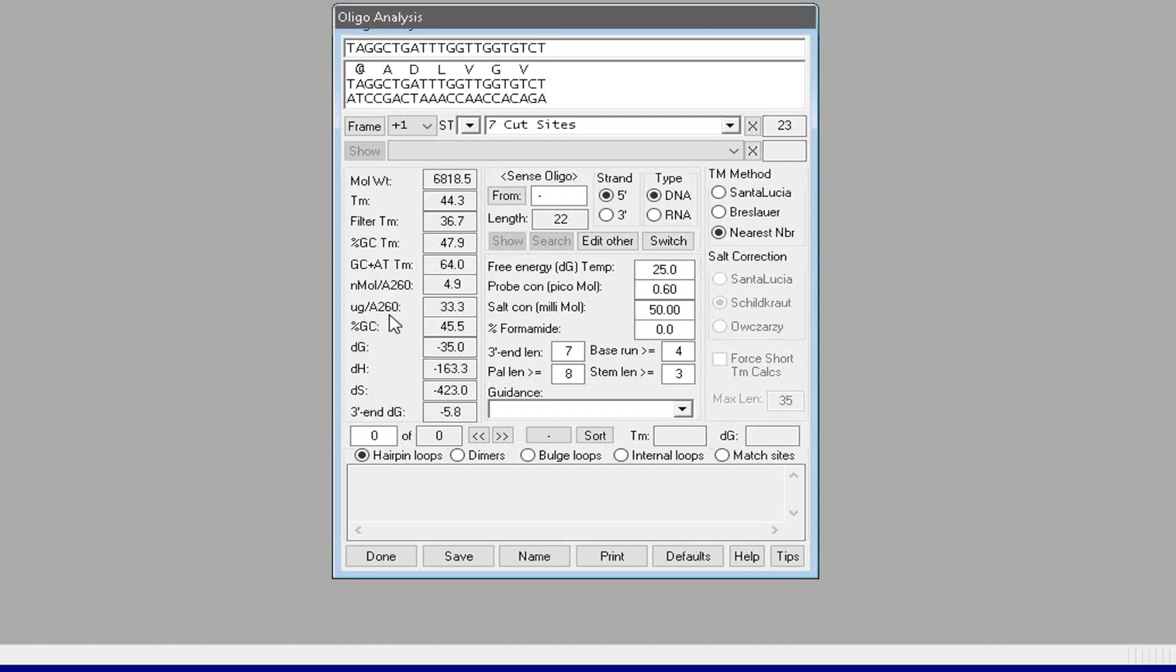The properties that also determine the qualities of the primers are hairpin loops, dimers, bulge loops, internal loops, and match sites.